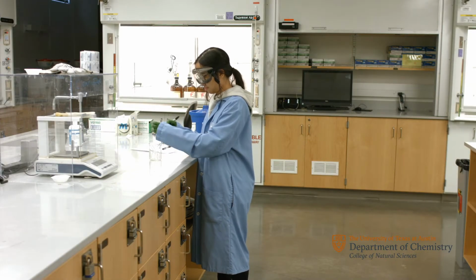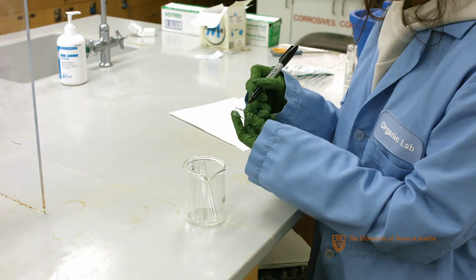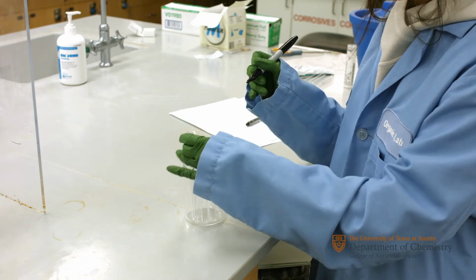Properly label each test tube and place into the beaker. Nice penmanship, Cecilia.